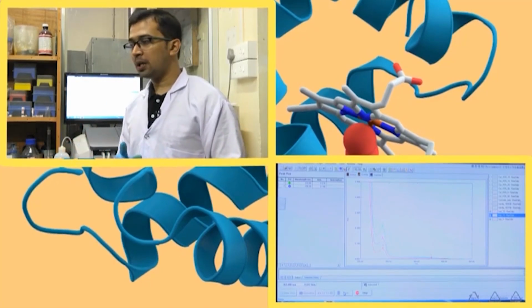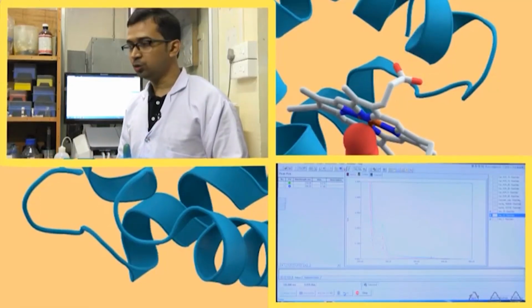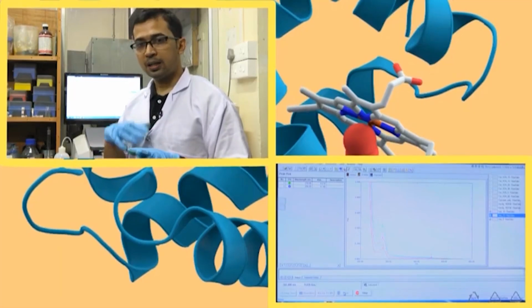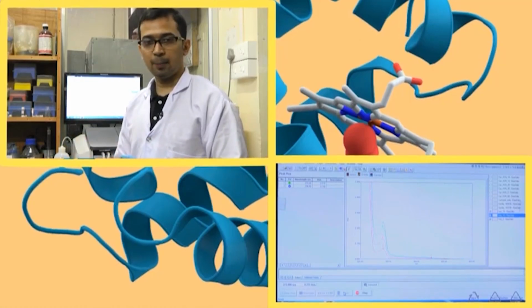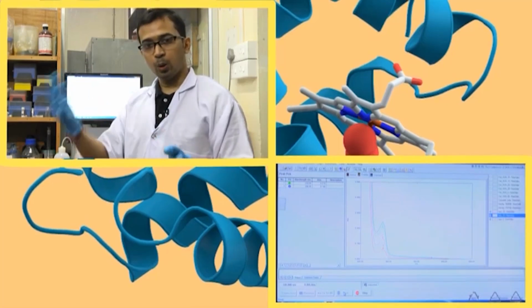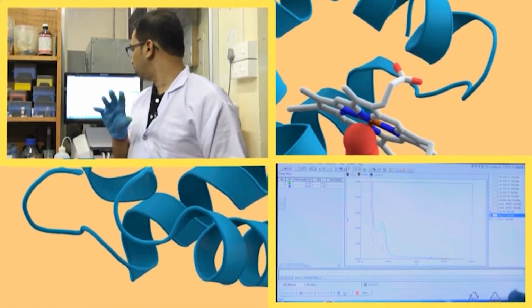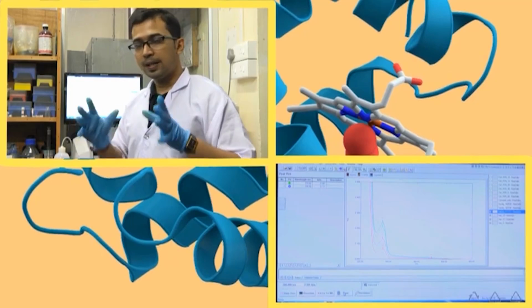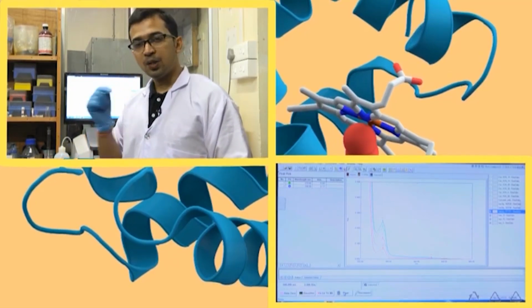Okay. So, the protein, meaning we are taking this HSA solution, human serum albumin, it has tryptophan residues and tyrosine also. We are not bothering about the tyrosine, because if we take the fluorescence spectra of tyrosine, we will not see its emission lambda max, since the higher quantum yield of tryptophan will overshadow the tyrosine. So, we are interested in the fluorescence emission of tryptophan. Okay. So, we will take the fluorescence emission of tryptophan in pure HSA, and to it we will gradually add the ligand.